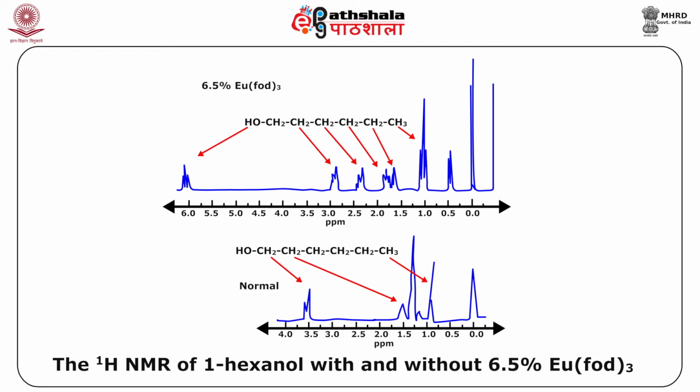You can appreciate it more by seeing these unsimplified and simplified spectra obtained by addition of the shift reagent. The shift reagent concentration is only 6.5%, and here we have used Eu(fod)3, the europium complex with fod, as the shift reagent.